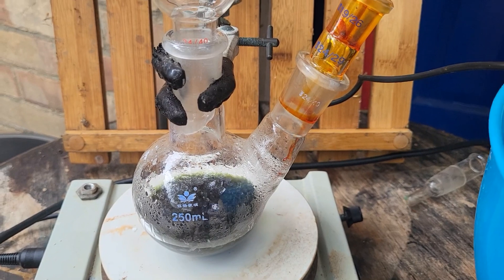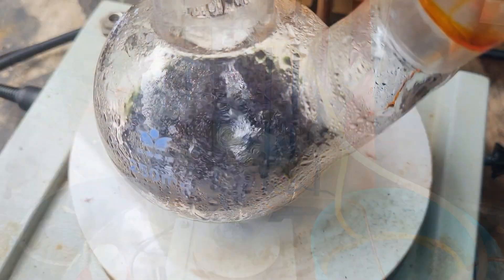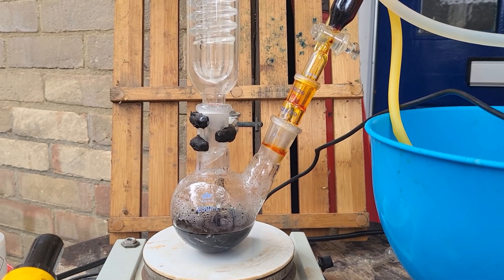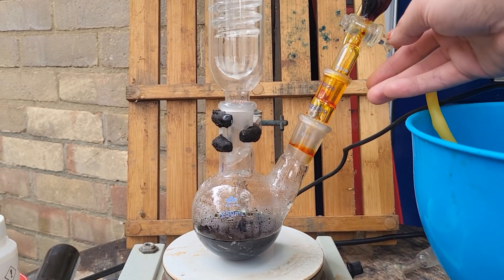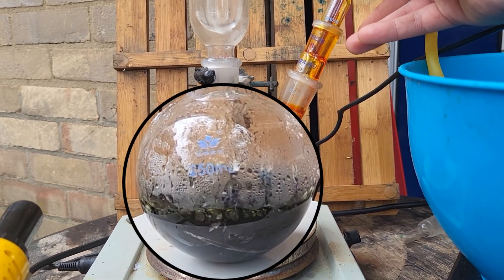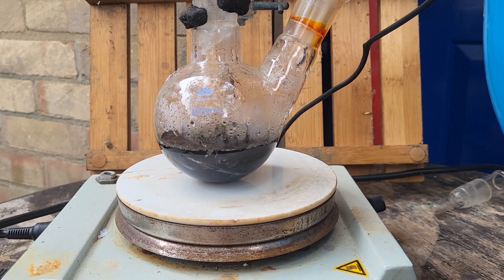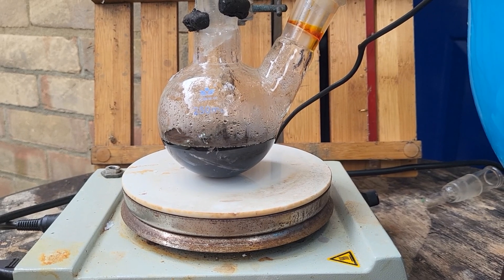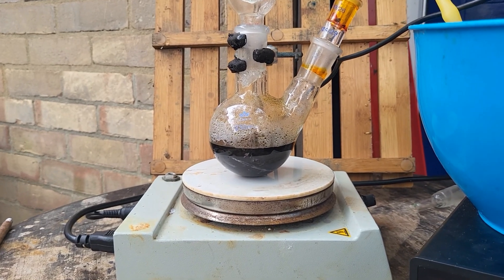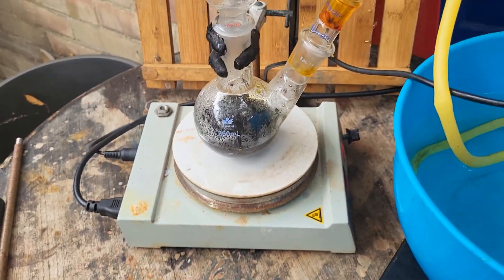The chromic acid is added dropwise. If the chromic acid is added too fast, a vigorous reaction happens, which I will demonstrate. This is not ideal, so slow addition is better. This can be left to cool down.